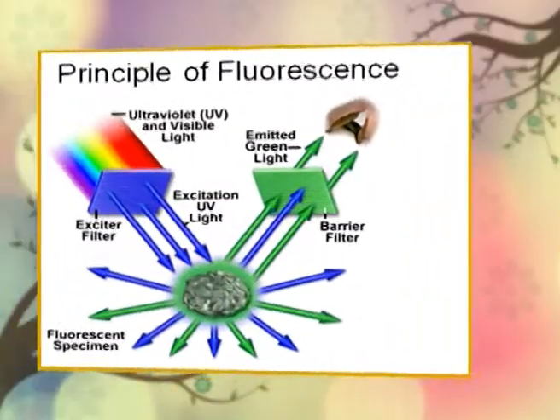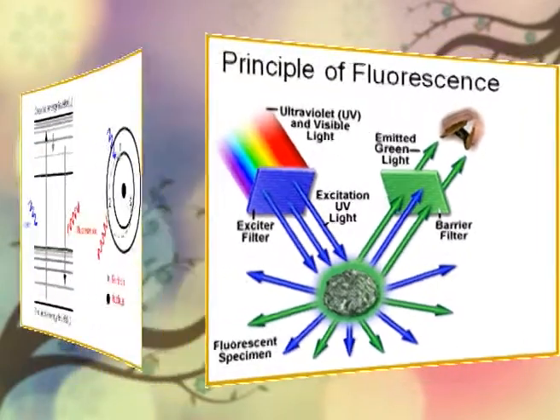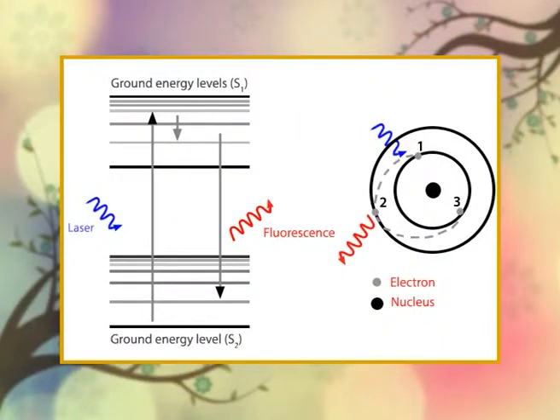The basic principle of fluorescence is that when an atom or molecule absorbs light, the energy of the photon absorbed lifts an electron to a higher orbital. The excited electron can now return to the ground state in either of two ways. It might do so in one single step by emitting light radiation of the same wavelength as that absorbed. The electron might, however, also return to the ground state in a stepwise manner through intermediate energy levels, emitting quanta of radiation corresponding to each energy level.